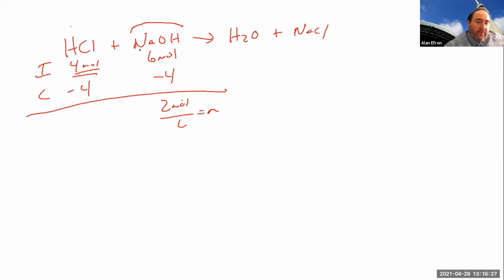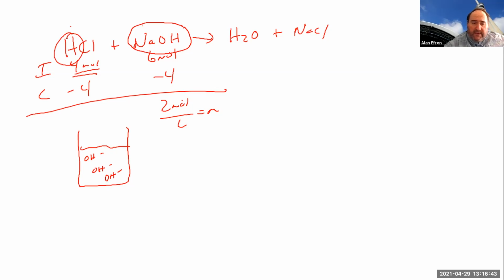But at that point in the solution, you pretty much have just sodium hydroxide. And if you continue to titrate, you're basically just dropping in hydroxide. All the H+ that was there from the original acid is pretty much used up. It's all over here at that point. That's why the major thing you have in that solution is this strong base.